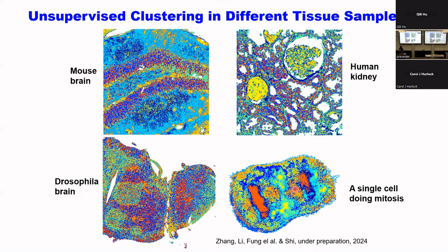You can see the subcellular resolution of newly synthesized molecules. And you can predict perhaps the red color pixels here are likely newly synthesized DNA, right? Because the shape looks like a chromosome region of interest. It's unsupervised, but you can actually confirm with other technologies such as Codex or fluorescence staining methods to confirm what type of molecule these are.